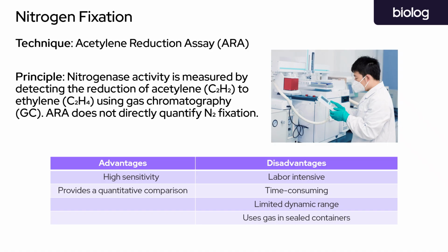However, this doesn't actually directly quantify nitrogen fixation, it just uses a similar pathway. There are a couple of downsides to this methodology. First off, it's really labor intensive and time consuming. It has a limited dynamic range, and it also uses an explosive gas in sealed containers.